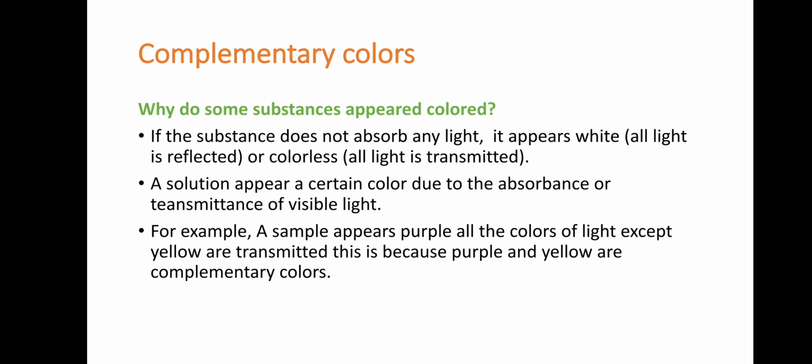Now we move towards the next concept, that is complementary colors. This is a very important term in spectrophotometry. The first question that comes to mind is: why do some substances appear colored? Some substances are colored or colorless.